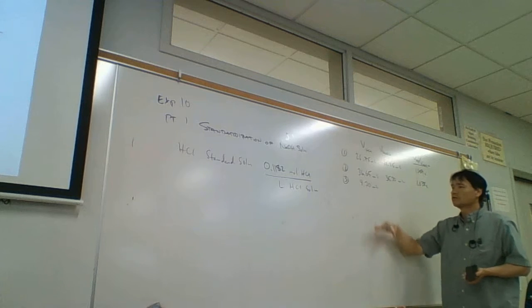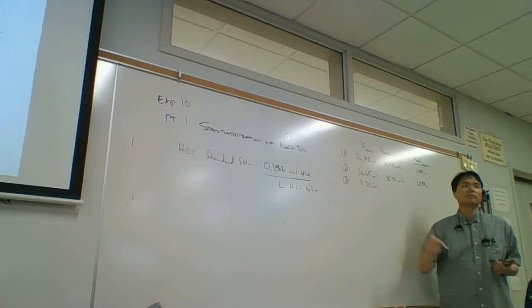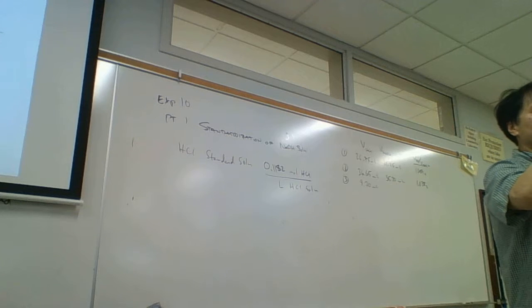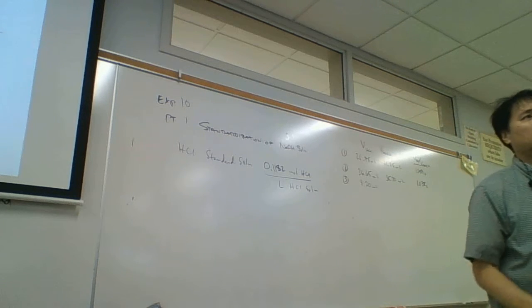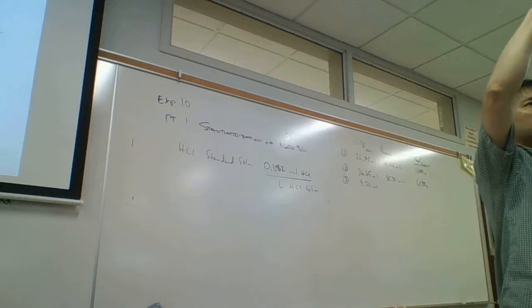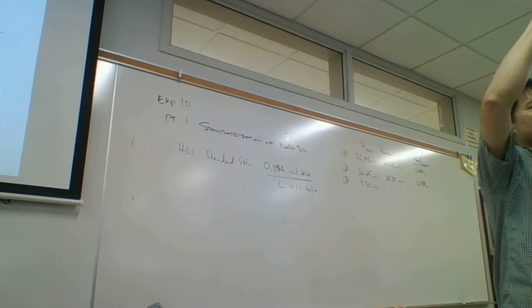We want a larger volume because when you work with small volumes, you have something called big relative error. If you work with very small volumes and make an error of 1 drop, that is a huge proportion compared to a 1 drop error in a big volume. So we try to use as much volume as possible.